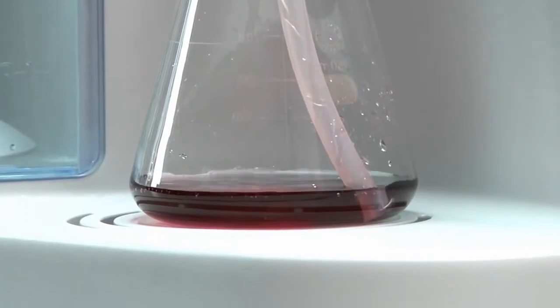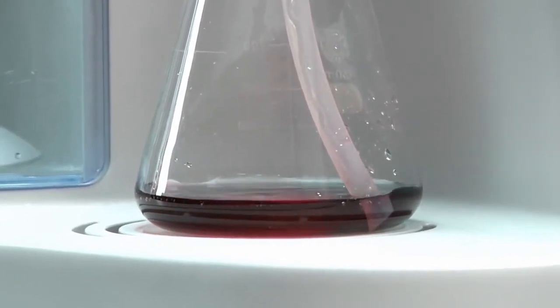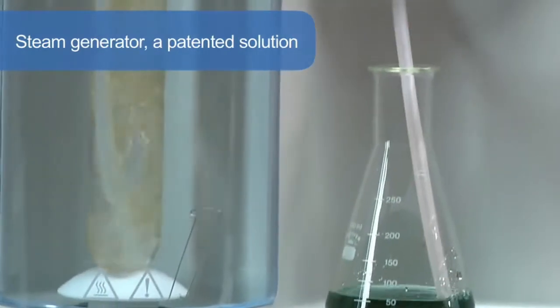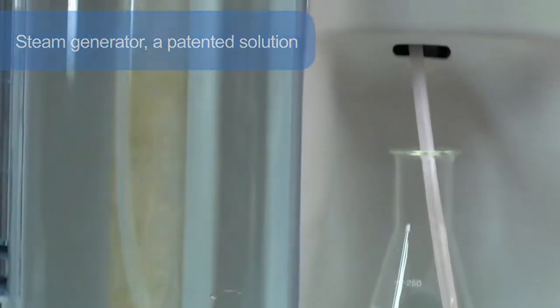Including the exclusive safety lever, the protective door and the service door. The steam generator is a patented solution and offers unique performance as it operates without internal pressure and is completely maintenance-free.